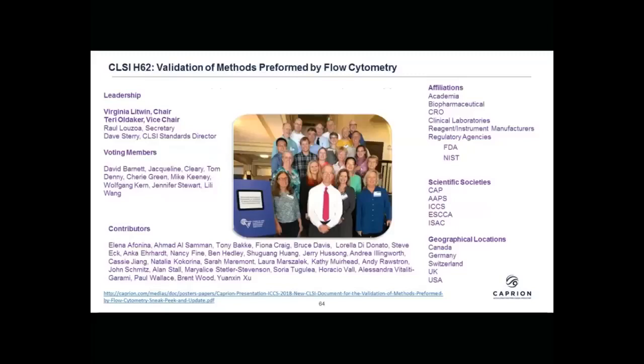So the other area is validation. All of us working in clinical laboratories as well as in drug development and the manufacturers, we would love to have guidance documents for the validation of flow cytometric methods. And we don't have any official guidance documents yet. Therefore, many of us from academia, biopharma, CROs, clinical labs, reagent manufacturers, and government agencies submitted an application to the Clinical Laboratory Standards Institute for a guidance document.